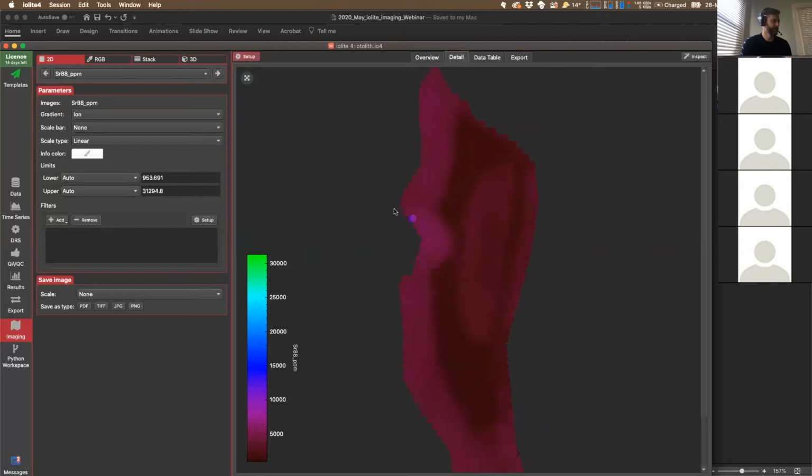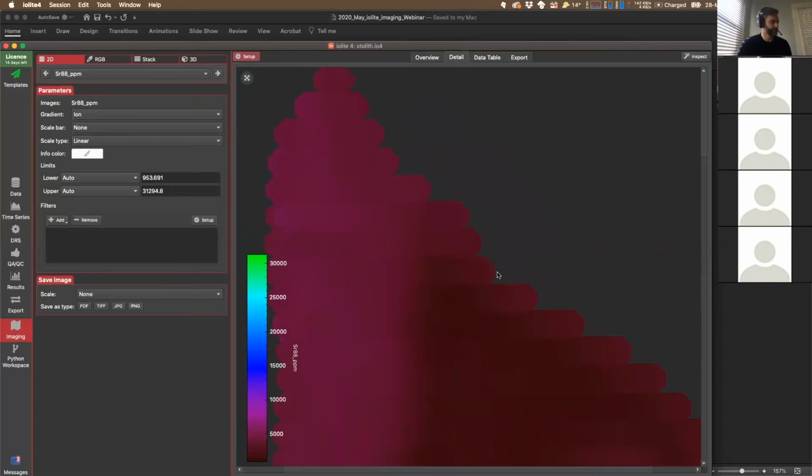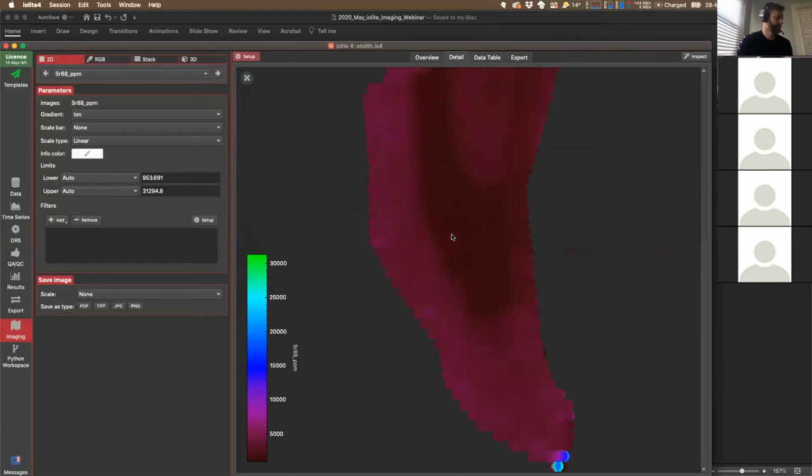As I mentioned at the start, you can actually see that we've used a round spot because you can see the edges of each of these tracks are curved. That's where you're actually seeing each individual circular spot being plotted, or rather each individual mass spectrometer measurement being plotted as a circle for its sampling area.